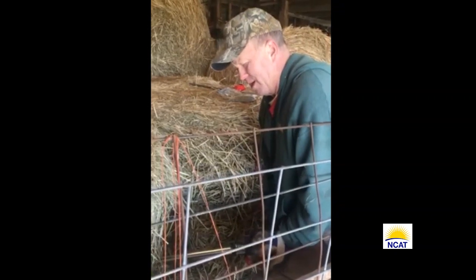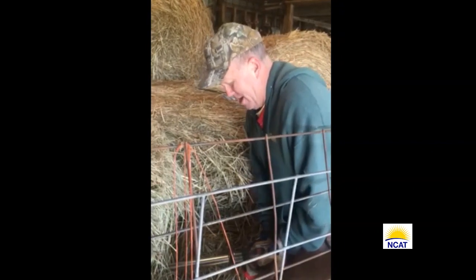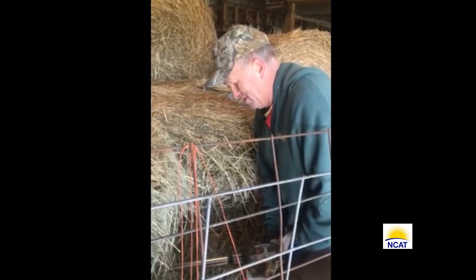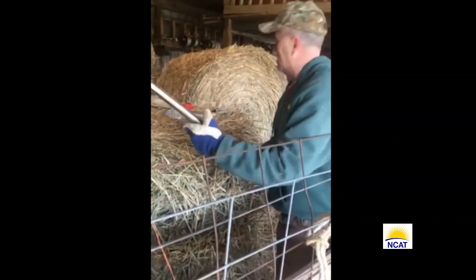I'm not pushing very hard because I want to let it just cut its way through. The harder I push, the more friction I get on it, and it's making my drill smoke. So I'm just going in as far as I can go. In this case, I got in about a foot.